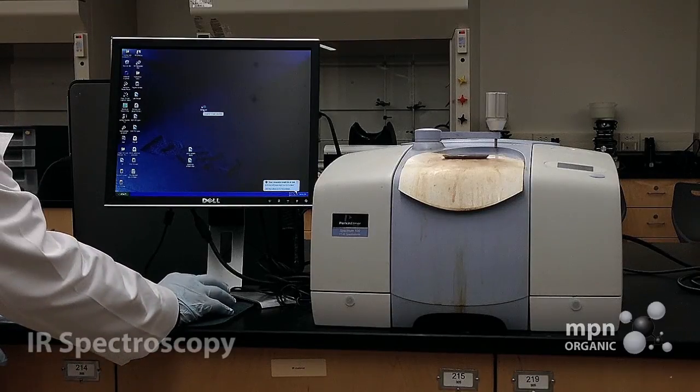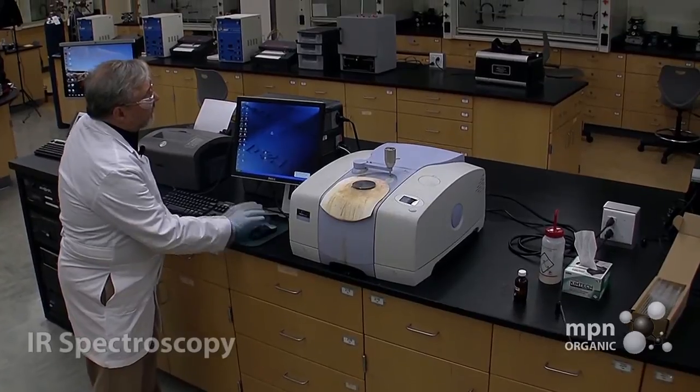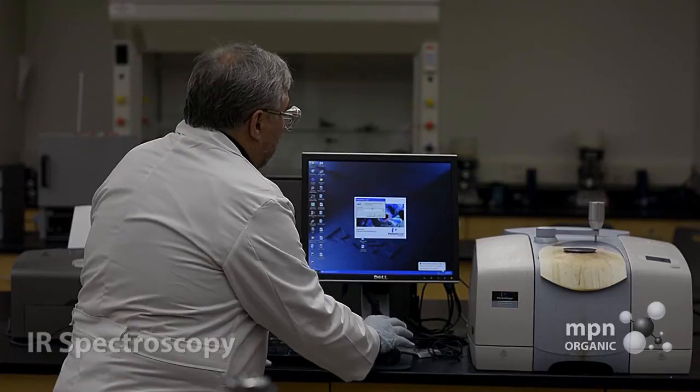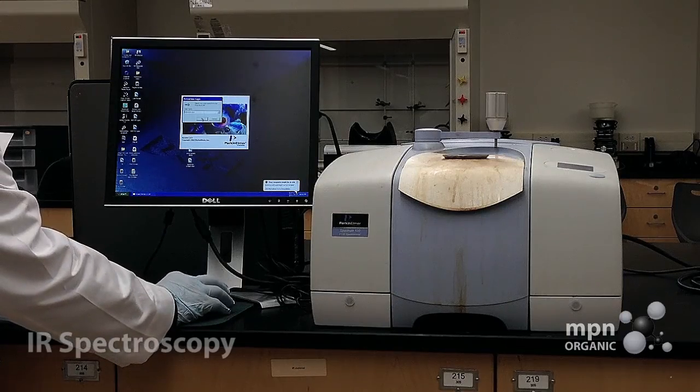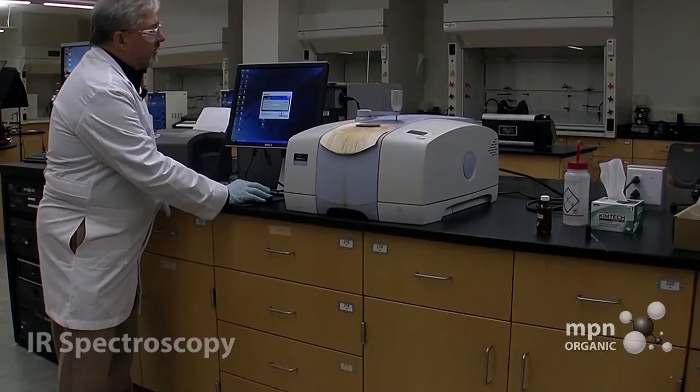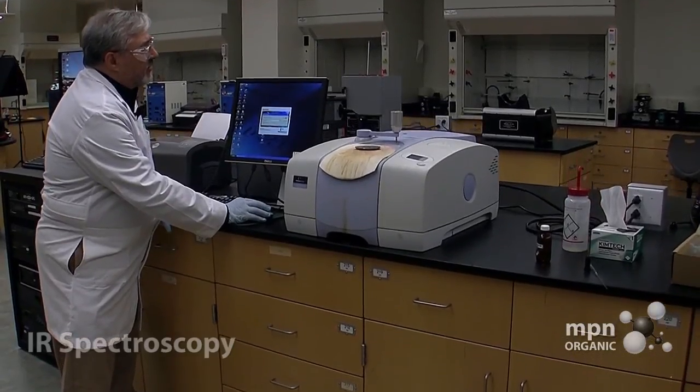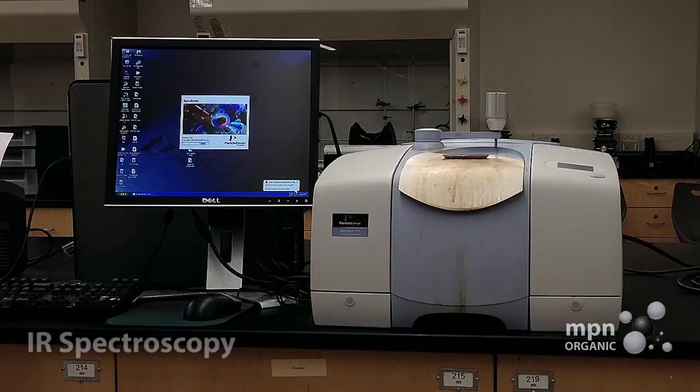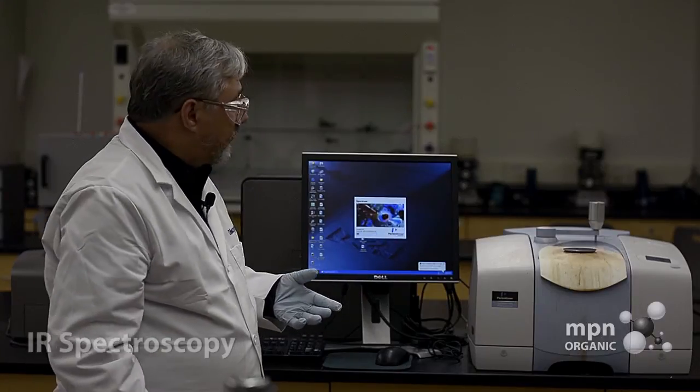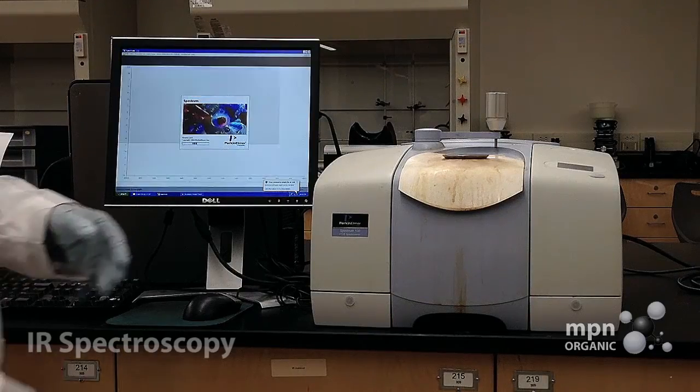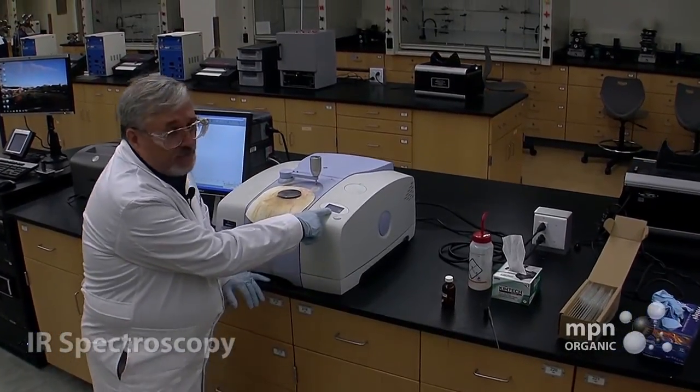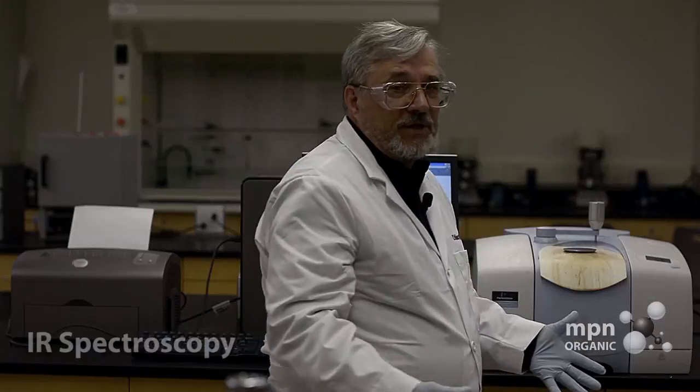And we come to this and it's going to ask you a couple of questions. You're going to say yes, I'm the administrator, and no, I'm not going to use the active IR assistant. And then it's going to come to the screen, which is going to record our infrared spectrum. Now over in this window here, it will say ready. You cannot take an infrared spectrum if it doesn't say ready.